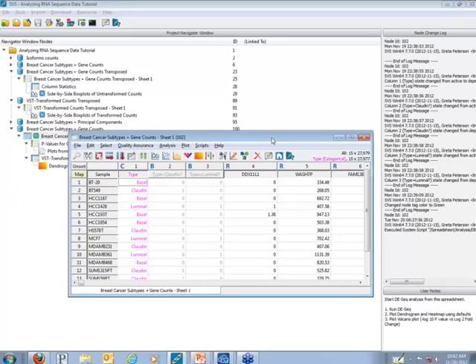Can you access Genome Browse from SVS 7.7? At this time, Genome Browse is a standalone program, and you cannot directly access Genome Browse from SVS. That will be integrated at some point in the future, but for right now, you do need to have both SVS and Genome Browse, and copy and paste to go back and forth between the two.